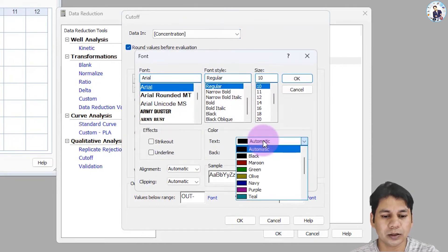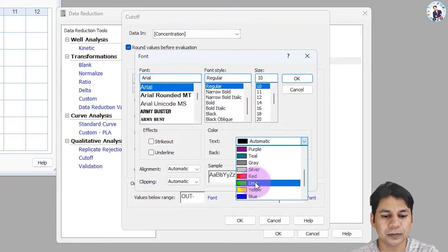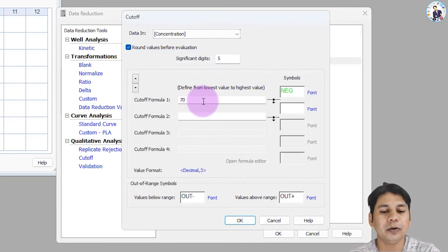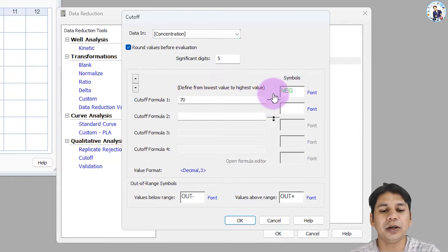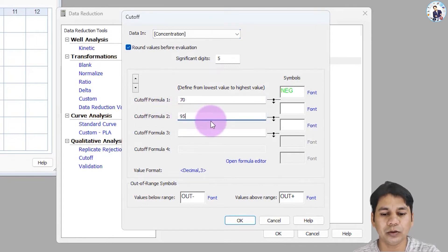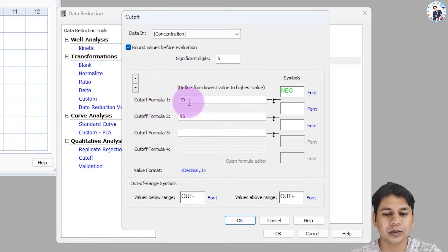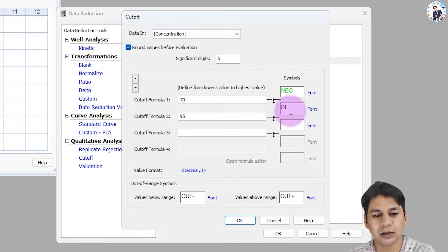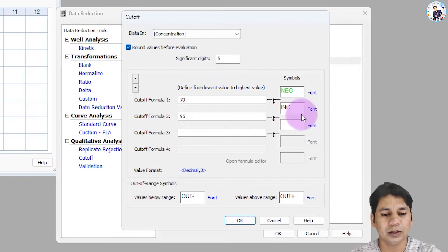I am selecting lime color for the negative result. So if the value is less than 70 pg, the corresponding well will be negative for this assay. The next threshold is 95 pg, and the value between 70 and 95 for this assay is an inconclusive result. You can assign a color for this range.